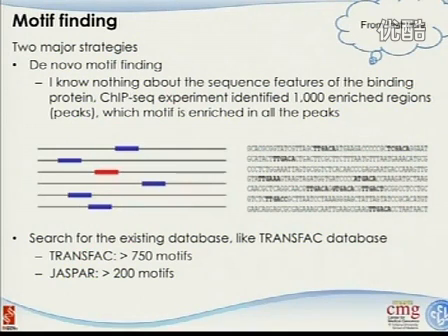If you haven't done this before, I'll tell you this is very, very complicated, because you don't know where they are, you don't know what the sequence features are, and most importantly, they are degenerate. So they do not look exactly the same; they are just roughly the same. There were many different algorithms around before the ChIP-seq experiment was developed, especially around 2005. There's a Nature Biotechnology review paper comparing different approaches. But those are the strategies you can use for de novo motif finding.